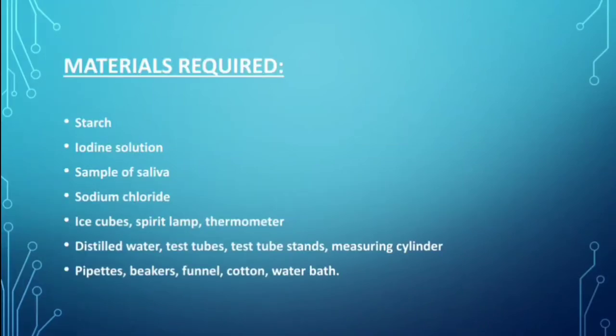The materials required for this process: starch, iodine solution, sample of saliva, sodium chloride, ice cube, spirit lamp, thermometer, distilled water, test tube stands, measuring cylinder, pipettes, beaker, funnel, cotton, and water bath.